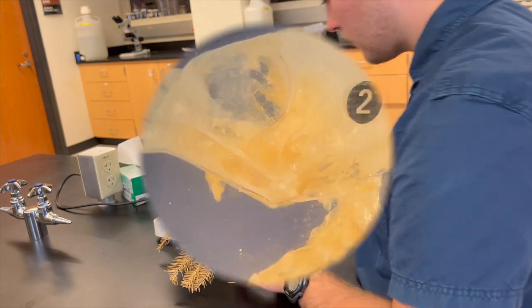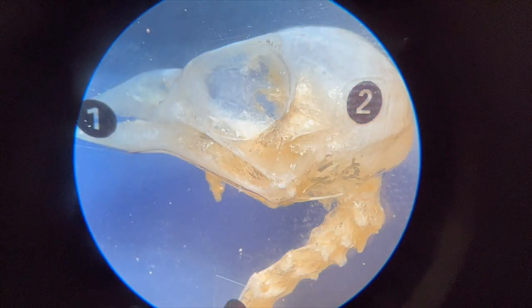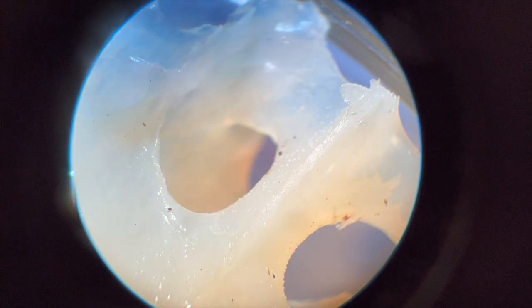When looking at a specimen through the lenses, there are two light sources that can be used for different purposes. The first is called epi-illumination, which allows you to light the sample from above. This is used for more surface level inspection of a specimen. The other is called trans-illumination, and that allows light to pass through a sample. This is helpful if you're looking for any structures within a translucent sample. Both of these lights can be turned on at the same time, but you should only use these two lights individually if you want the best results, as this prevents the two light sources from interfering with each other.